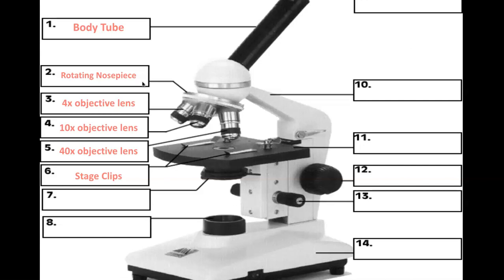In order to make an appropriate slide today, we have 2 types of slides. One is just a solid flat glass slide. The other one has a small well or divot in it. You will need to pick up that slide and feel it to figure out what direction the divot is in, because when you first look at it, it kind of looks like a little bit of a bubble of water just on the slide.